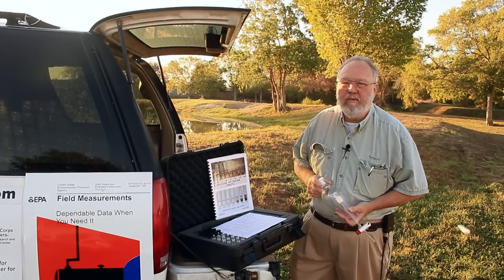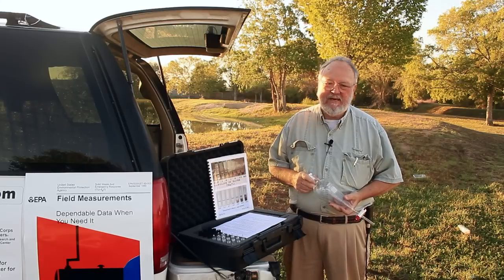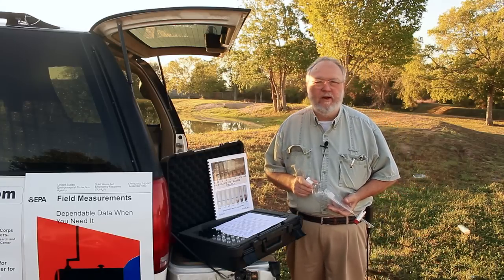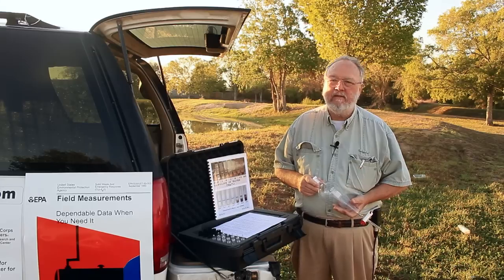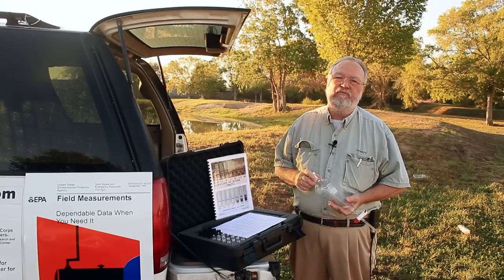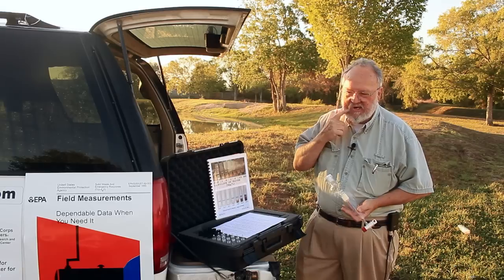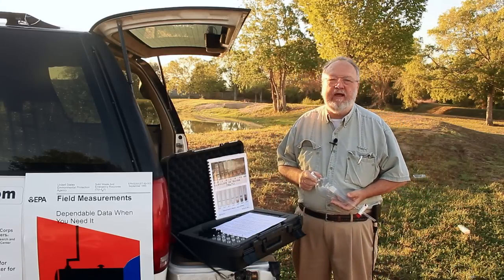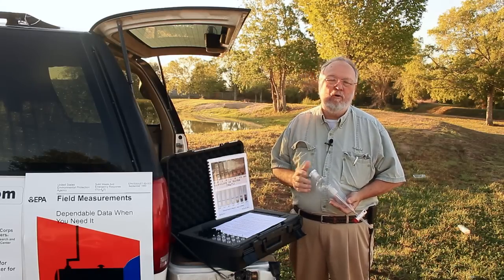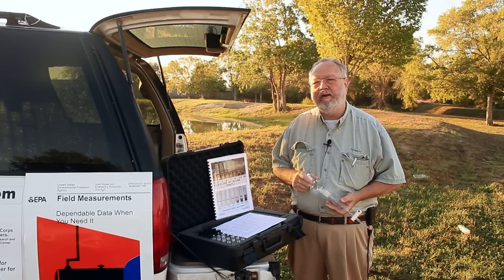Good morning, I'm John Hanby. I'd like to tell you about our water kit and I'll start with the invention of it. It was 1986, shortly after I'd left a ten-year tenure as Environmental Health Director at NASA. I had this idea that I had seen in one of our classical chemical texts about using a Friedel-Crafts reaction. I went out into a laboratory and tried this extraction method and it worked. I got these extremely robust colors that detected parts per billion amounts of contaminant in water samples.